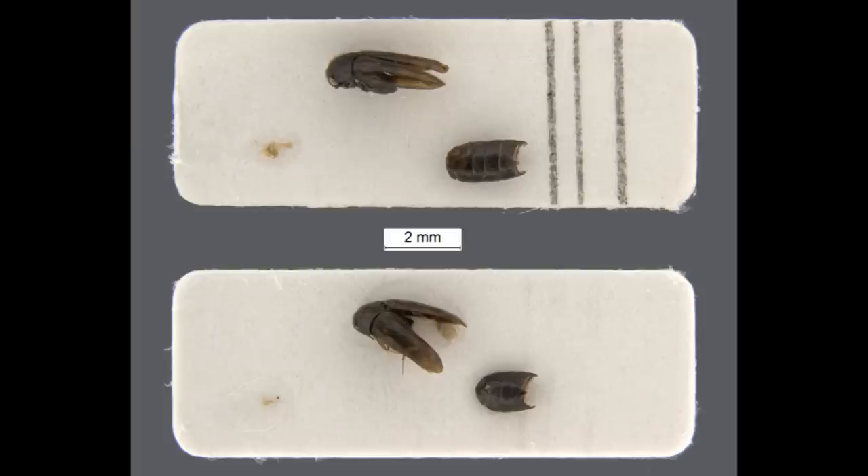Once examinations have finished, the separate body parts, including the genitalia, should be mounted on a cardboard rectangle for curation as shown. Water miscible glue is recommended, so the specimen can be easily soaked off if further examination is required. Housing the genitalia in a micro-vial with glycerol is not recommended, as it has a reduced lifespan.